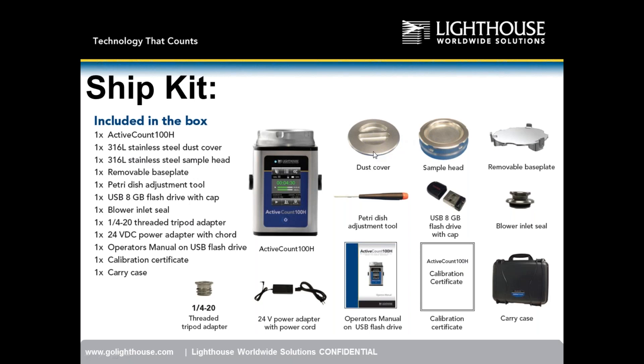The ship kit includes: a 316L stainless steel dust cover, a 316L stainless steel sampling head, the removable autoclavable petri dish holder, a petri dish adjustment tool, an 8GB flash drive, the stainless steel blower inlet seal, a threaded tripod adapter, power supply, operation manual, calibration certificate, and a carrying case. This is what the unit comes complete with.